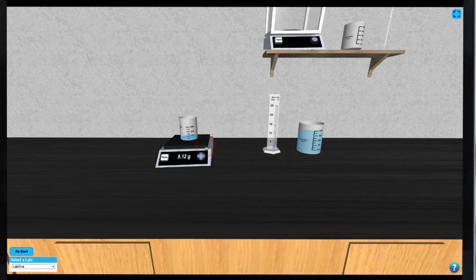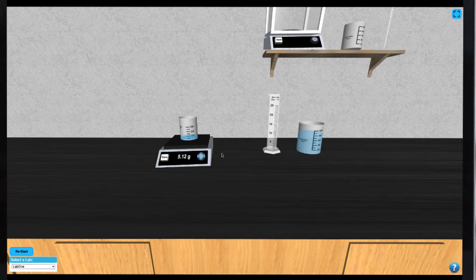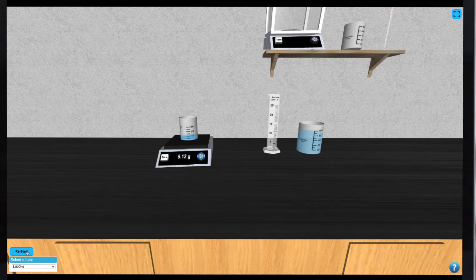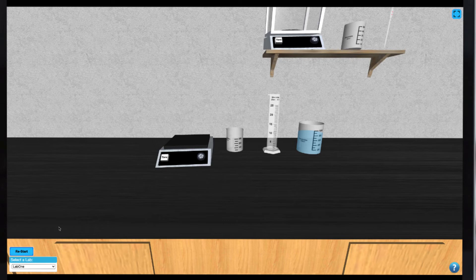This procedure may be repeated several times using the different pieces of glassware and different balances. Simply click on the Restart button to try again. You can access Part 2 of this experiment by selecting it from the drop down menu on the bottom left of your screen.